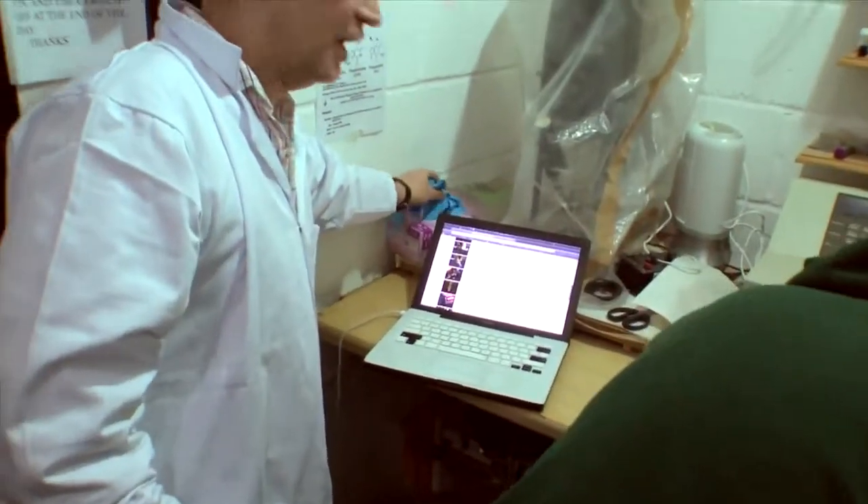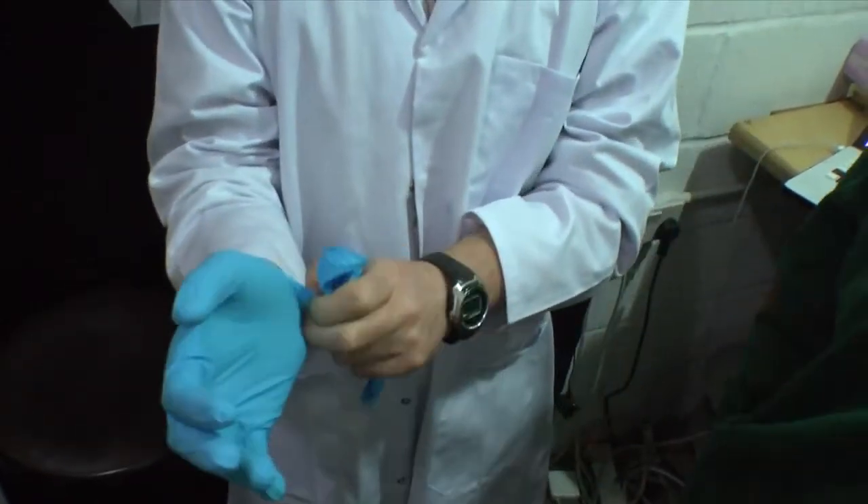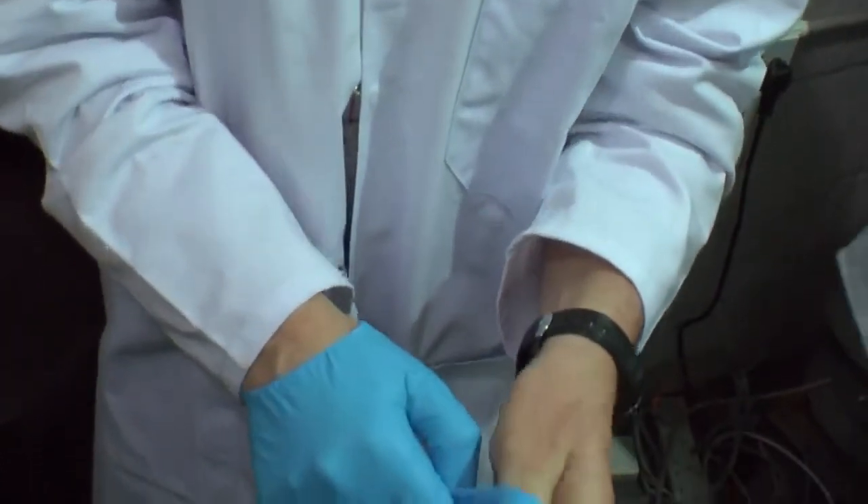I put on gloves. It's not a talisman, that means nothing. See, if we want to actually get a license, we have to do certain things. For certain procedures we have to wear lab coats, for some we have to wear gloves. I think it's quite good to get into best practice now, even though as Will says, it's probably just ritual. As an anthropologist, you'd like that kind of thing.